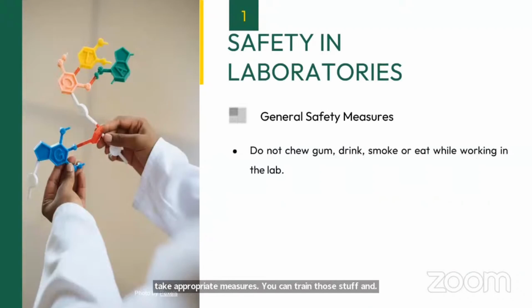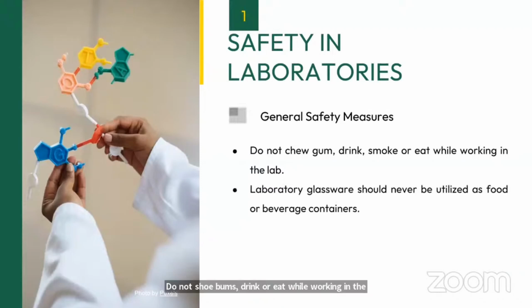Do not chew gum, drink, smoke, or eat while working in the lab. A very common scenario: we have seen people sitting in the middle of the lab and drinking tea or smoking. Anyway, I don't think anybody is smoking, but eating and drinking, I have seen in many places. So no, not at all. It is not recommended.